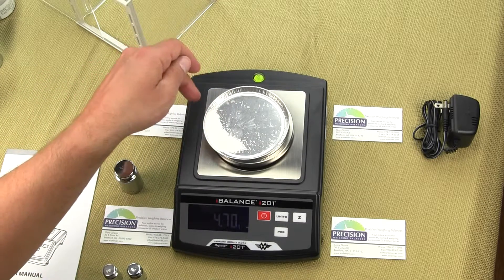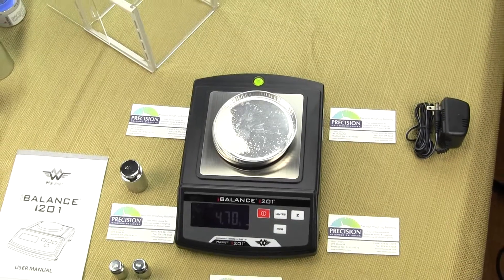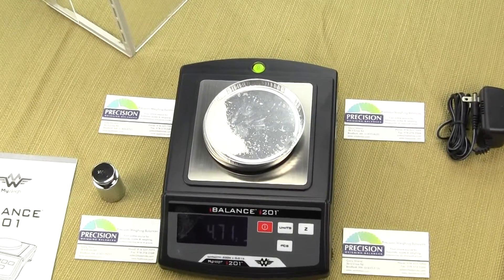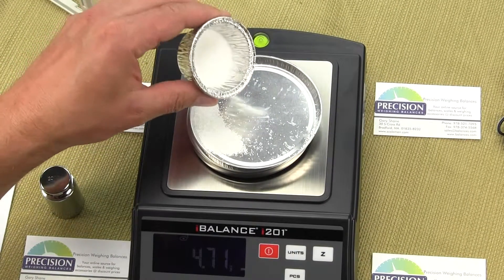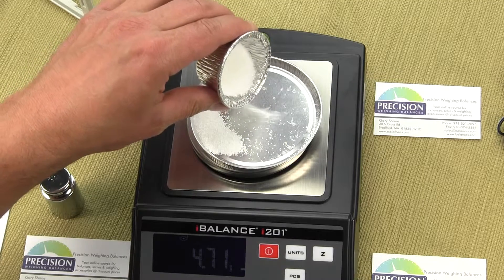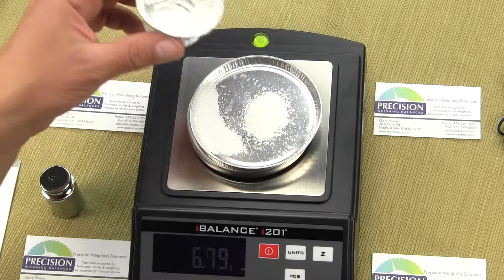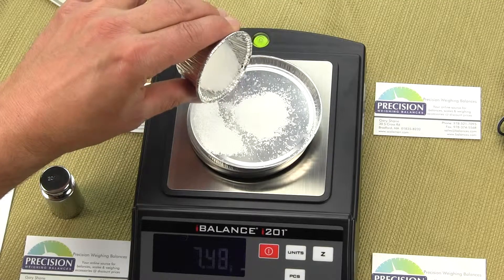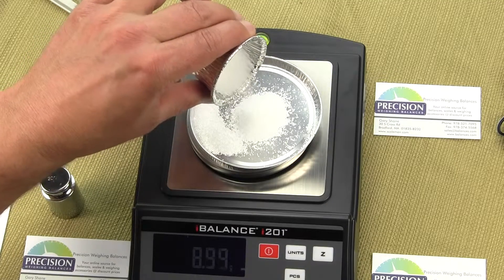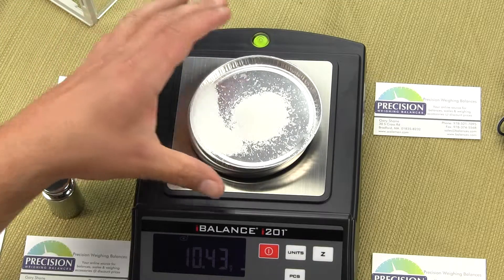The first thing we'd like to highlight is how sensitive the scale is — how it picks up small quantities of weight and how fast it records them. We'll put on a weigh dish. We already have a little material on there. I'm going to sprinkle on some more — this is actually table salt — and you'll be able to see the response time. The unit is in grams, and as I apply weight, the scale is pretty responsive.